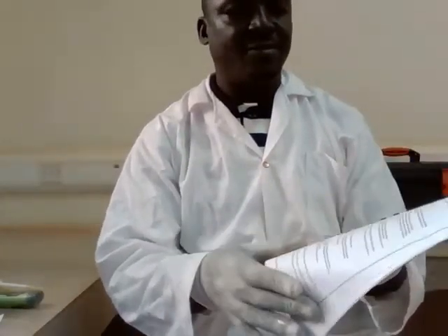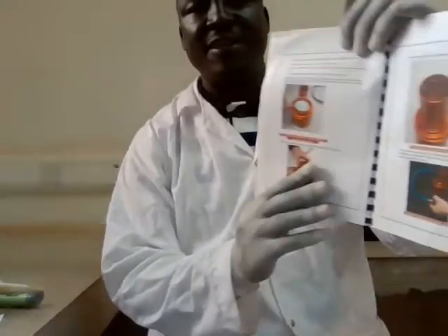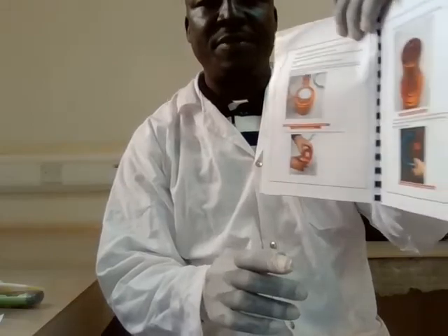Then thereafter, you count the colonies according to the appearance. And the procedure of what kind of colonies to count will show you which colonies to count.